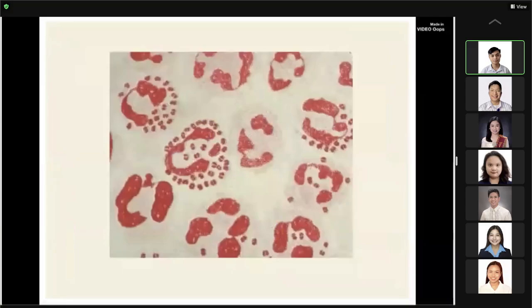There are certain gram stain specimens that will require us to include the location of the organism, just like in urethral discharge for males. If the consideration of the clinician is gonococcal urethritis, for the clinician to say that there is a true infection, we must include in the report that the organisms are seen intracellularly.